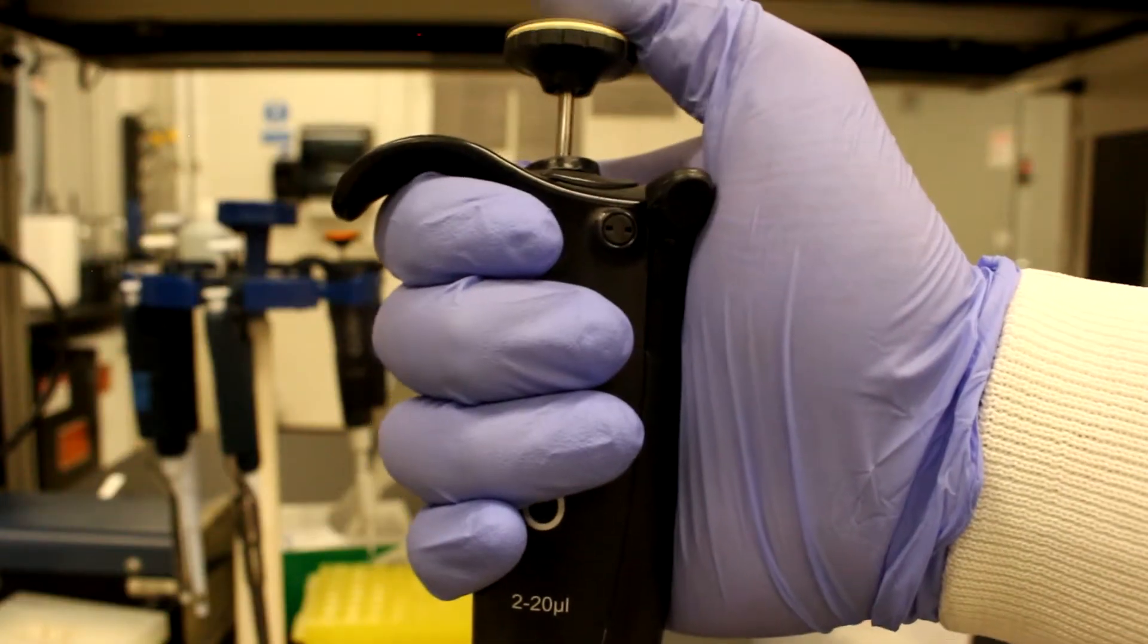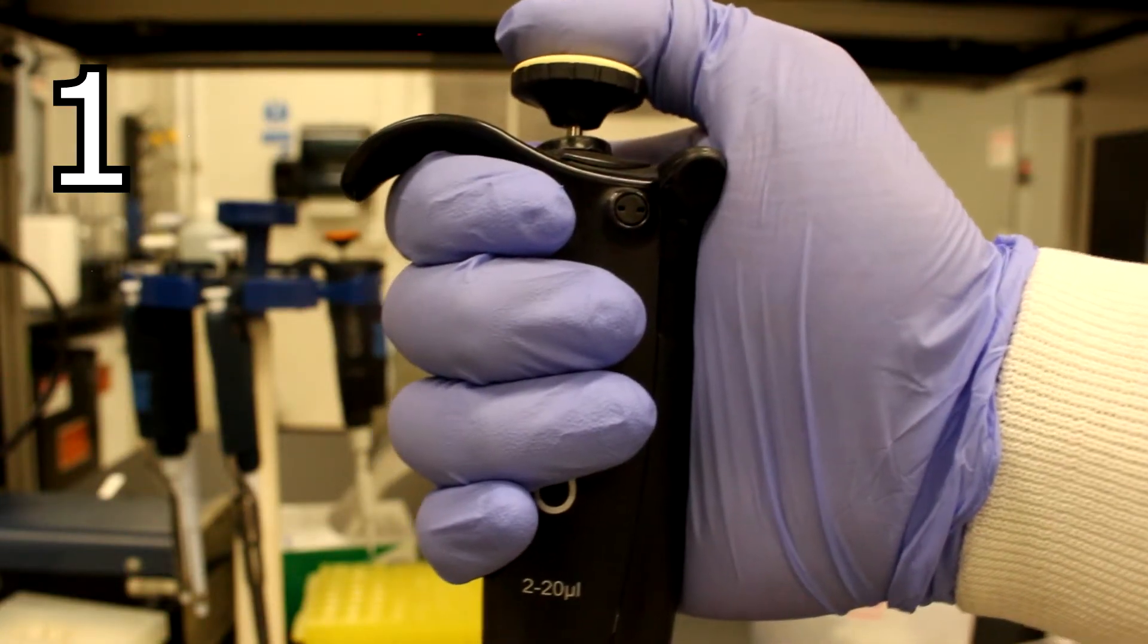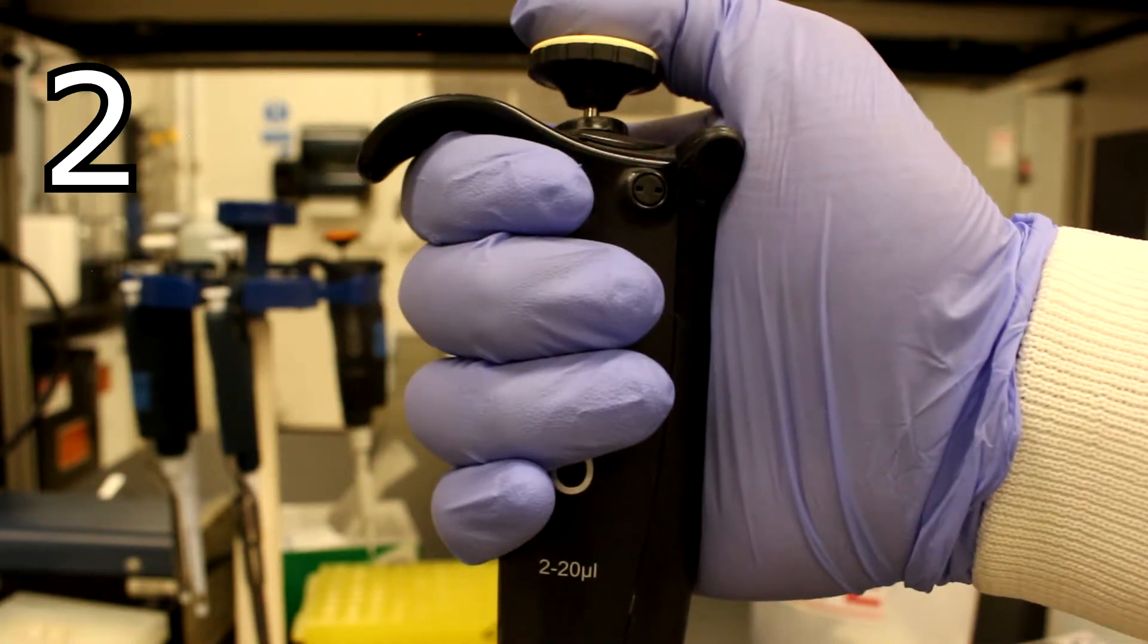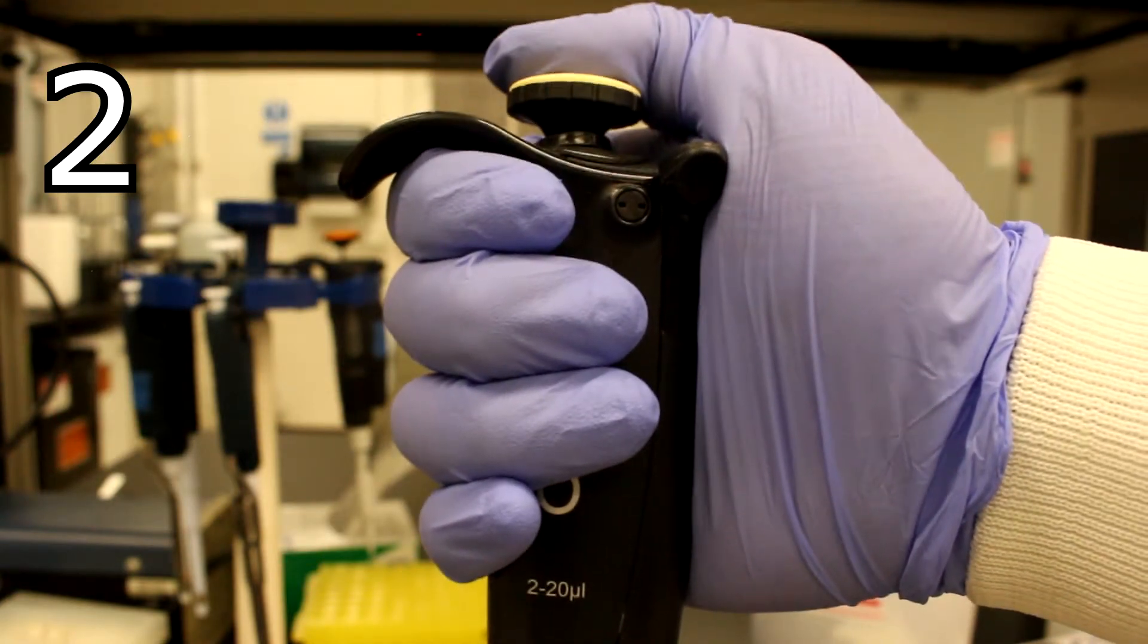A pipetter has two stops. The first stop indicates accurate measurement of the set volume, and the second is used to expunge the remaining fluid from the tip.